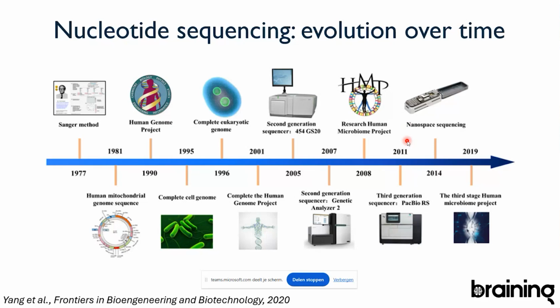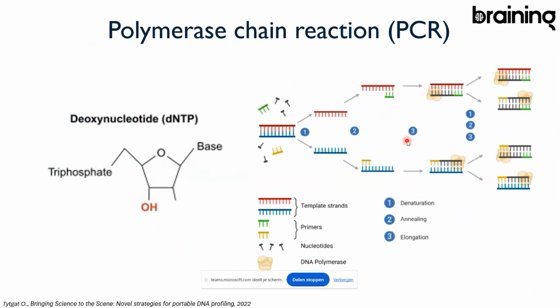Before I do that, I will make a small sidestep into another thing that you all have heard of, and that is the polymerase chain reaction. And why do I want to talk about the polymerase chain reaction? Because the polymerase chain reaction is often the conceptual basis of those sequencing techniques. So if you would make sequencing super simple, basically you're talking about a polymerase chain reaction.